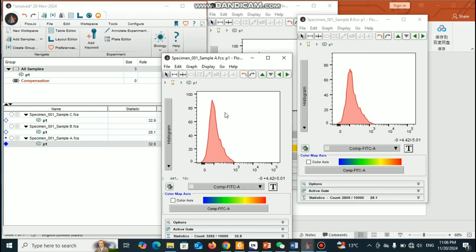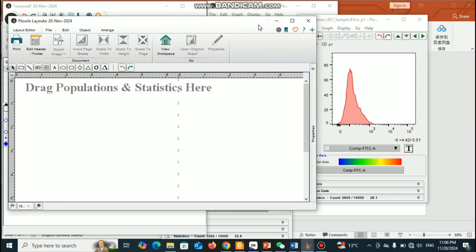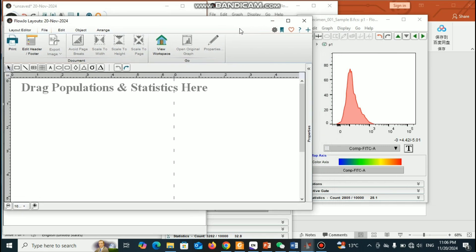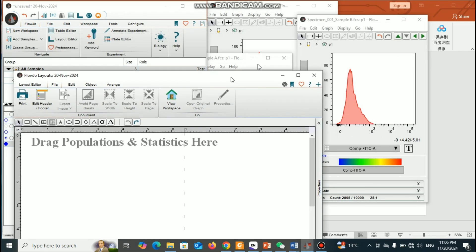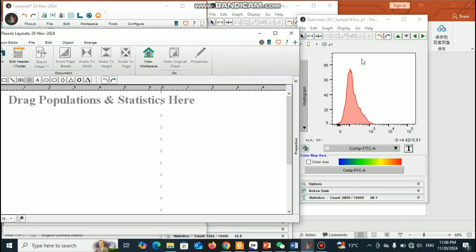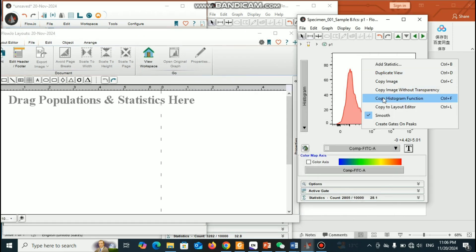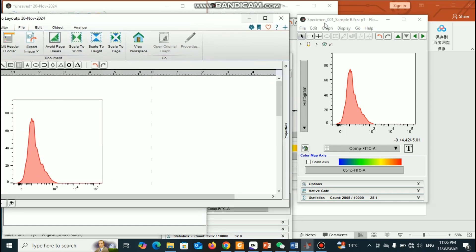Now what you can do is go to the Layout Editor — you have to click that one. You can see this window and you will make the analysis here. You can drag from here, or you can right-click and select 'Copy to Layout Editor.' You can see it already appeared here.